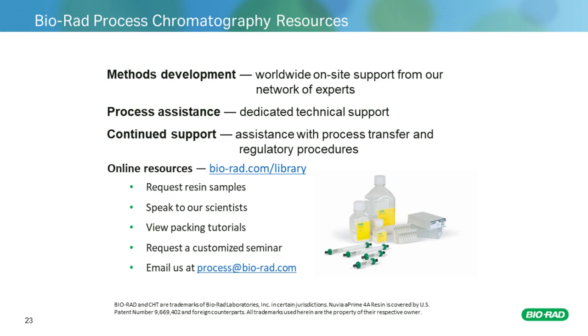Okay, and can DOE results be analyzed without the need for an analysis software program?